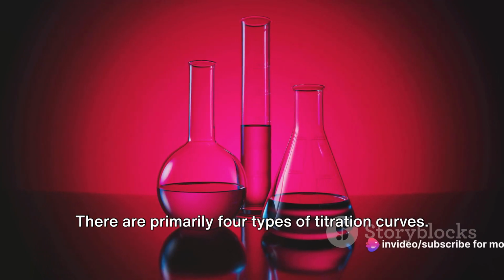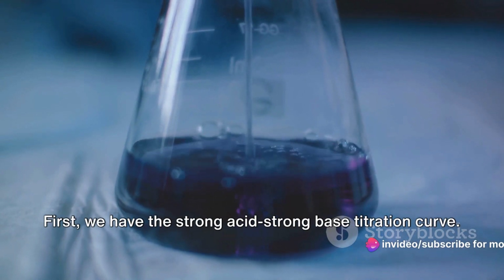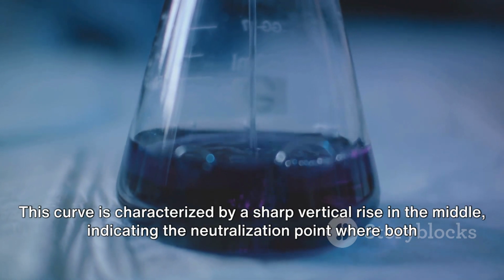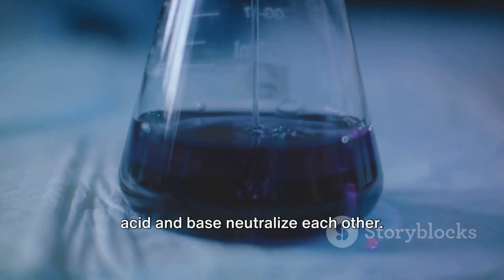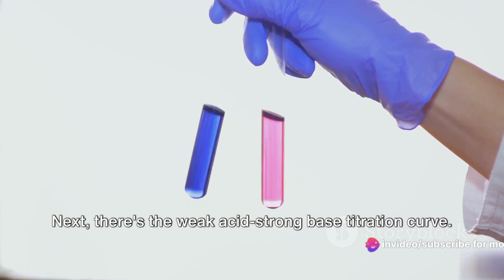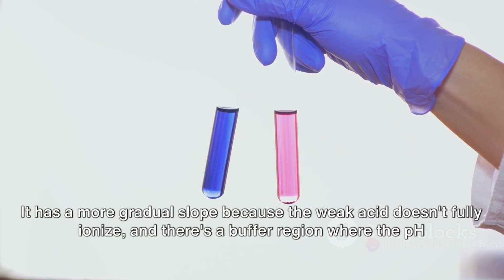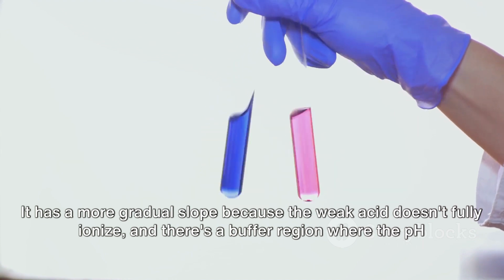There are primarily four types of titration curves. First, we have the strong acid-strong base titration curve. This curve is characterized by a sharp vertical rise in the middle, indicating the neutralization point where both acid and base neutralize each other. Next, there's the weak acid-strong base titration curve. This one's a bit different. It has a more gradual slope because the weak acid doesn't fully ionize, and there's a buffer region where the pH changes minimally.